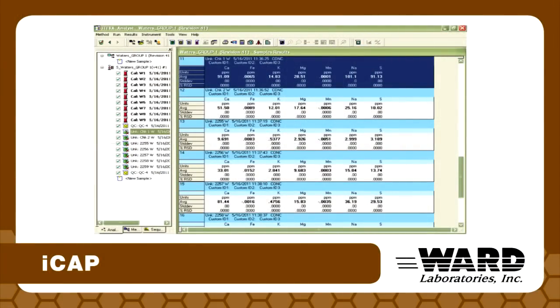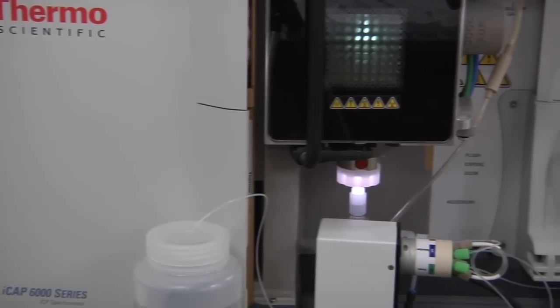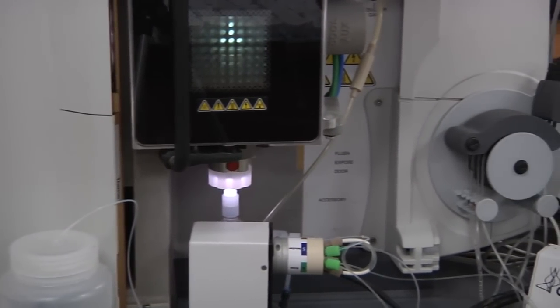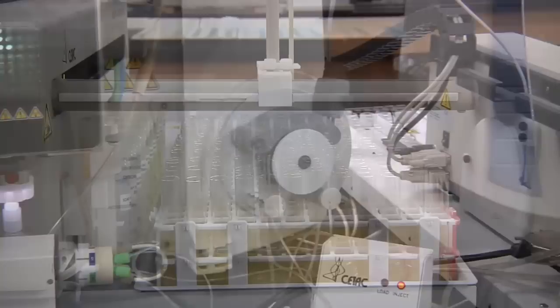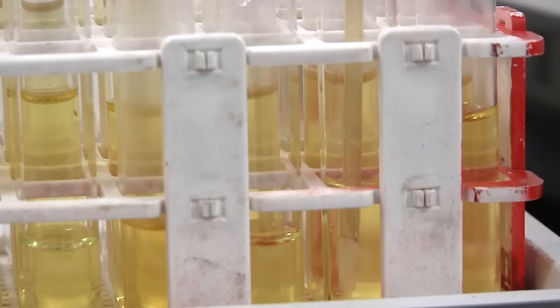Autosampler for ICAP analyzes potassium, calcium, magnesium, and sodium by ammonium acetate extraction and analyzes zinc, iron, manganese, and copper by DTPA extraction.